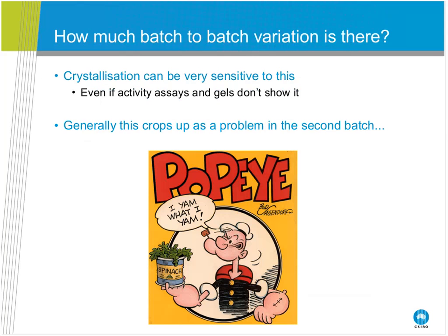And a particularly egregious example of this was when I was in Uppsala. We were working on rubisco, which is the most abundant enzyme in the world, and this particular rubisco sample was from spinach. We got crystals which grew to ridiculously large millimeter sizes practically overnight.